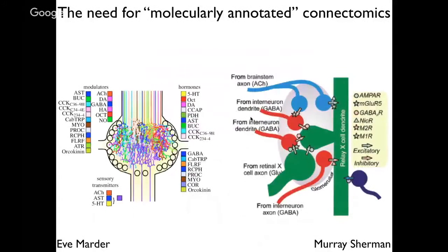And in terms of doing a Rosetta brain type concept of being truly comprehensive, this is going to go over similar ideas as Tony presented, but from a slightly different angle. There are a few other things that we would like to be able to see, that it is still an outstanding challenge for electron microscopy to give us. One of them is basically molecular.